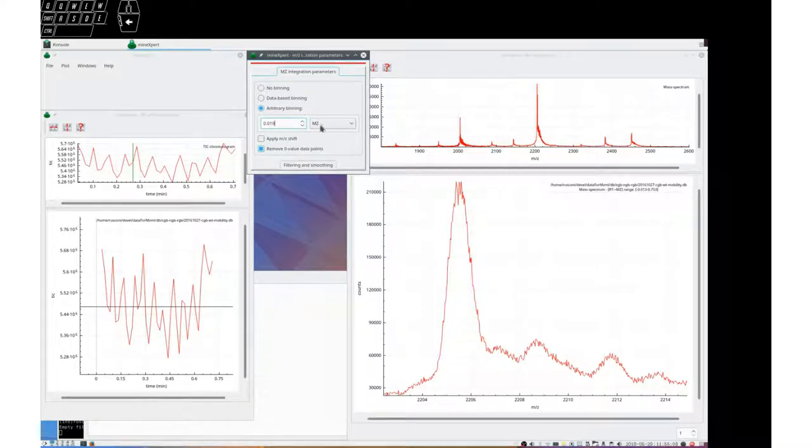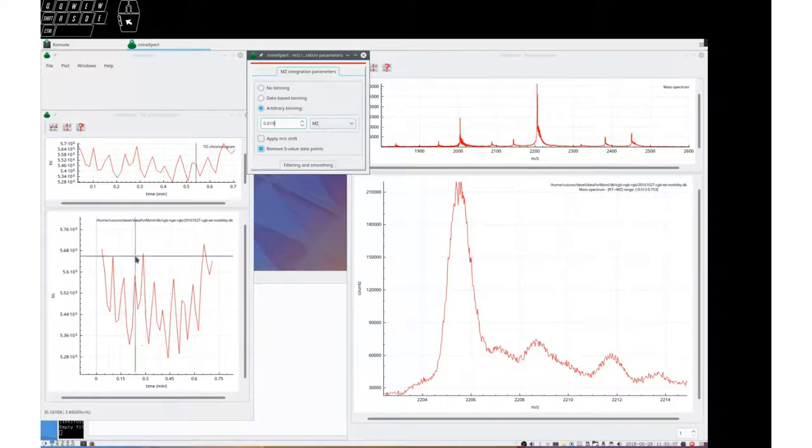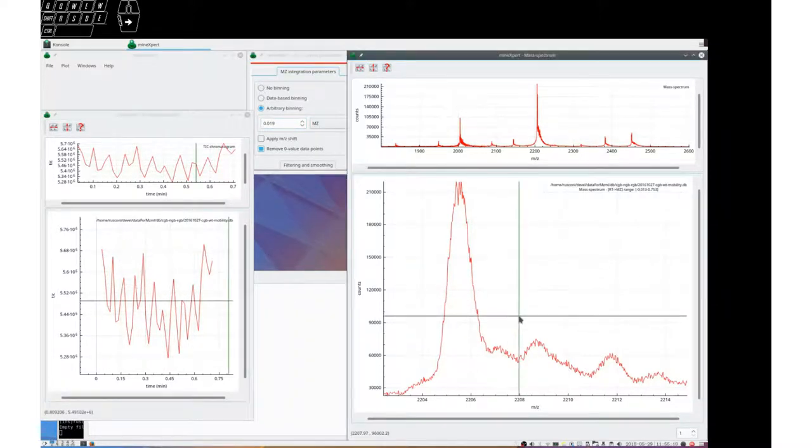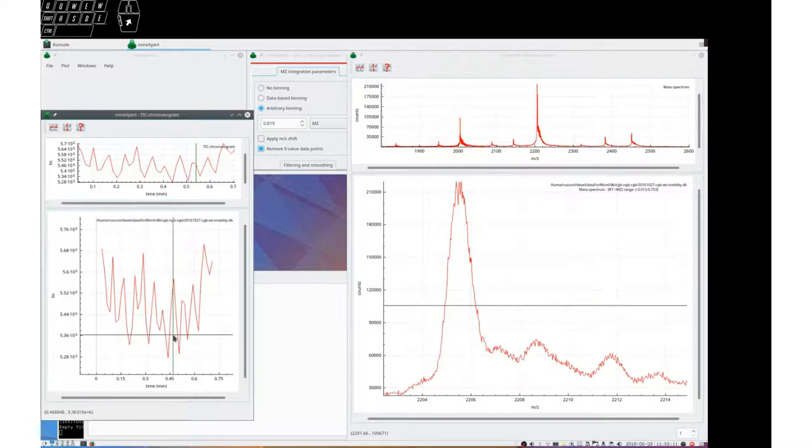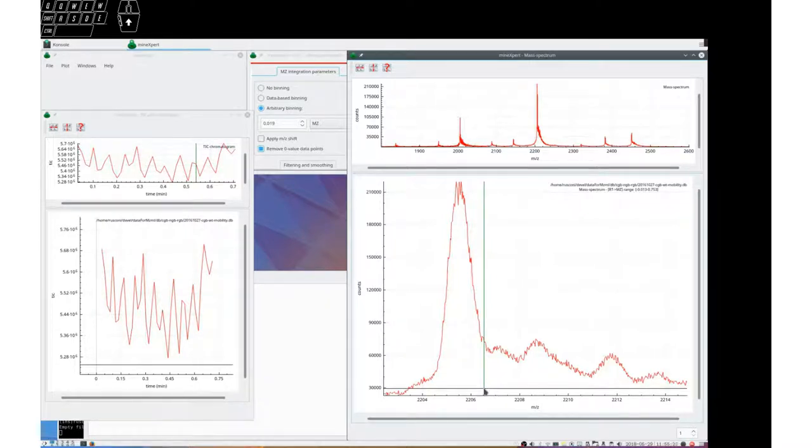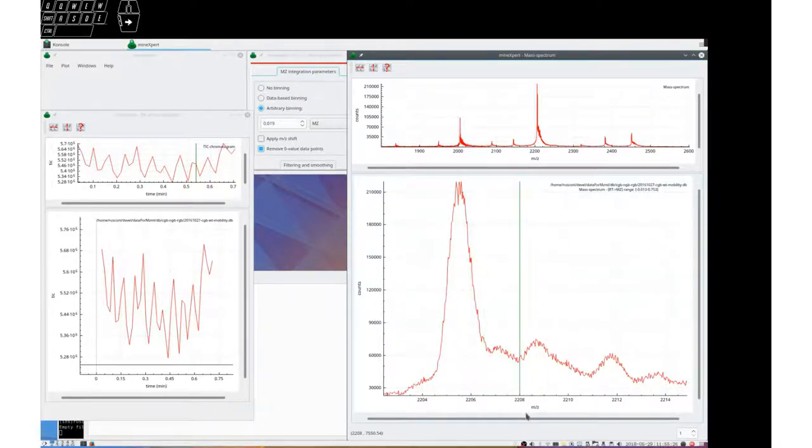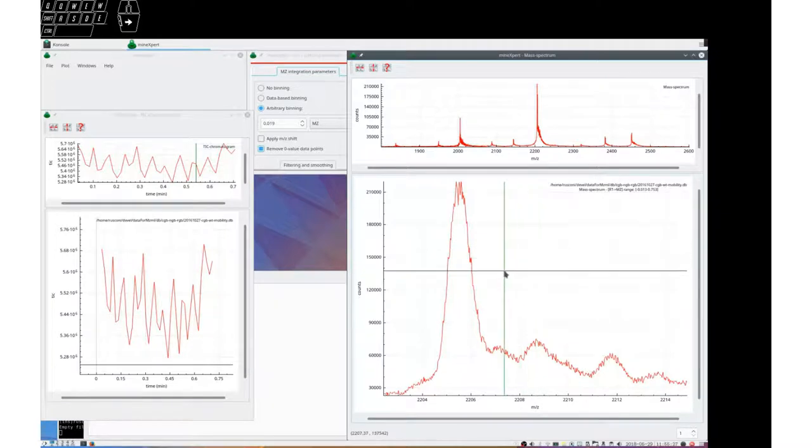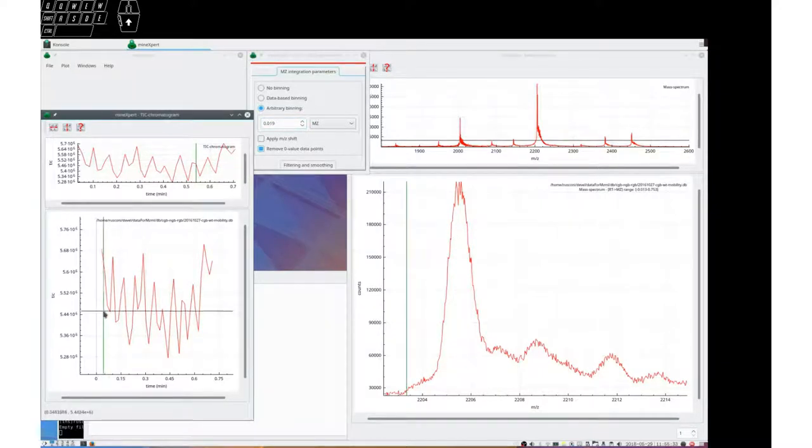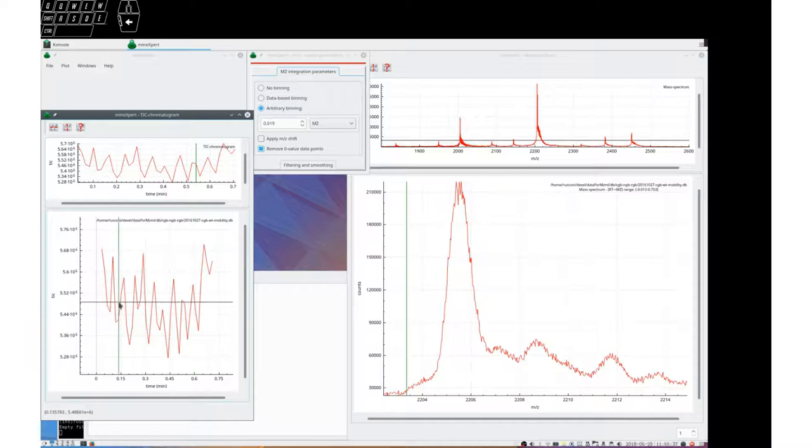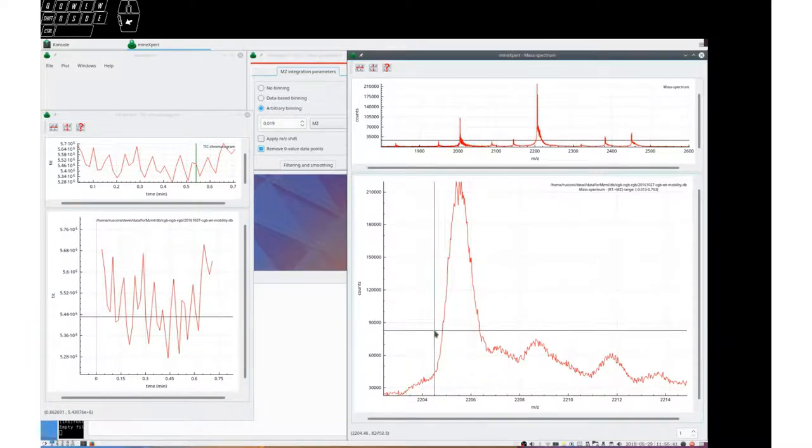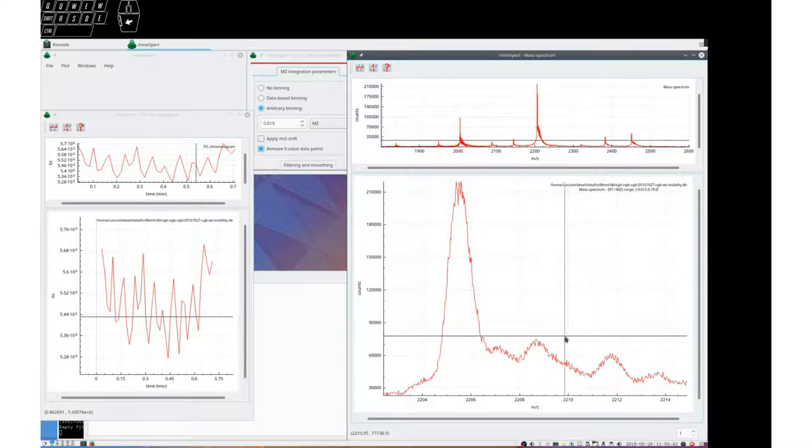That means that before starting the integration, the program creates an empty spectrum. When I say empty, that means there is null intensity. But it creates the MZ axis with cells that have that size. And then it goes through all the spectra of the data file and starts combining these spectra into the various cells initially computed.